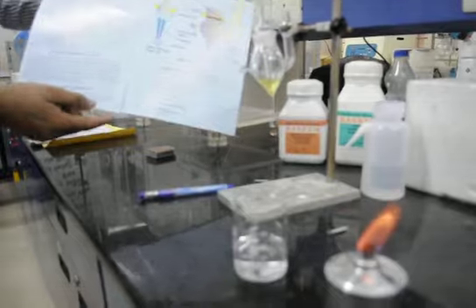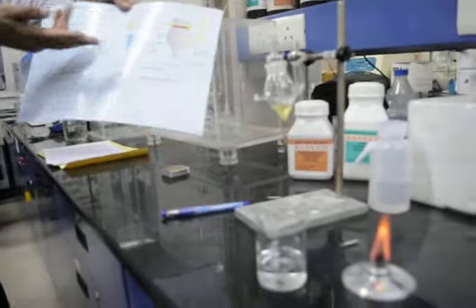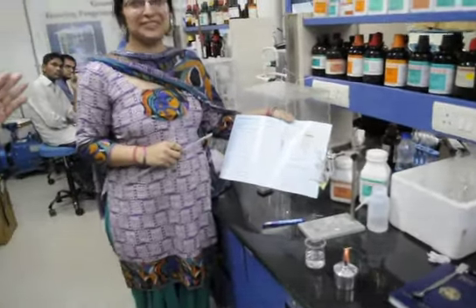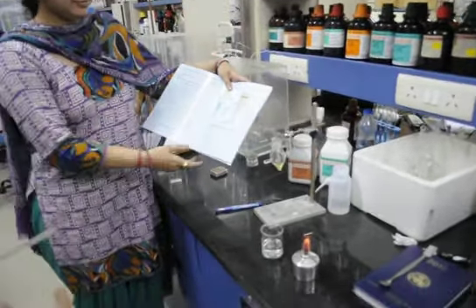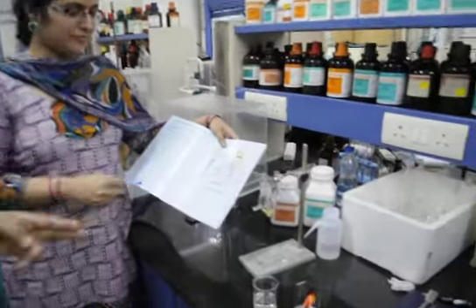Madam — who is already an organic chemist — is now demonstrating this device. She is holding the instrument. Instead of using the conventional method, we are using this device, which is very easy for students to use. Using the conventional method, chances of accidents in the laboratory are more, but by using this device, chances of accidents can be minimized and wastage of sodium metal can also be minimized.